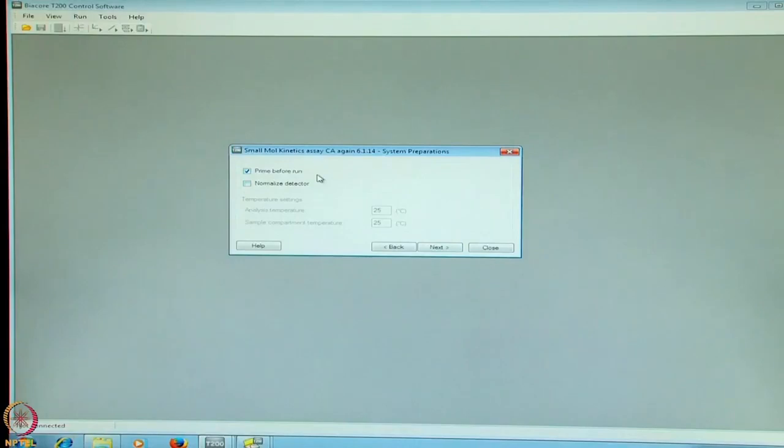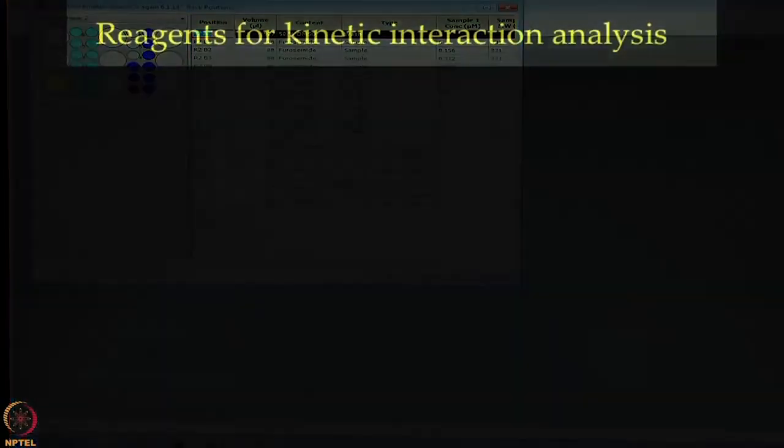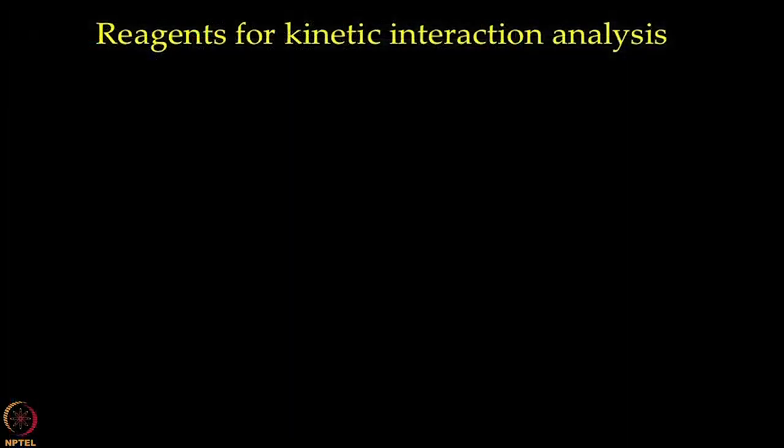We have highlighted prime before run and the following are the rack positions for various samples with furosemide at different concentrations, 50% DMSO, buffer for the startup, solvent correction, 8 different solvent correction sample vials provided for a successful kinetic experimentation of furosemide binding to carbonic anhydrase. As per the volumes listed in the table, we prepare the following samples and reagents.